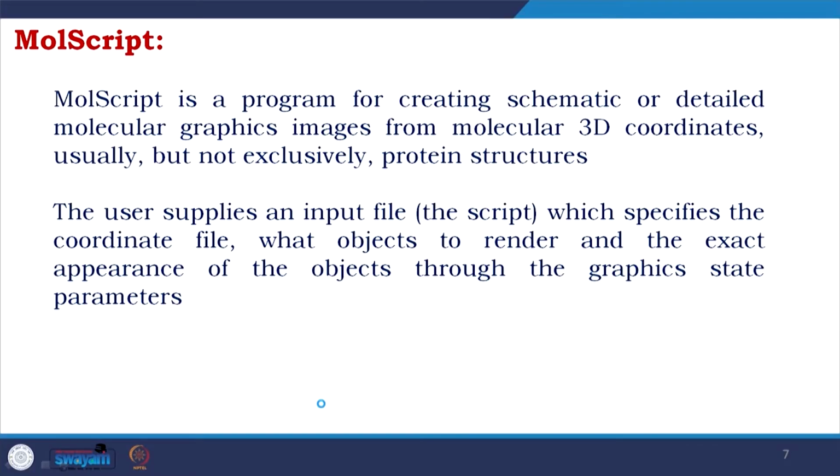The user supplies an input file. Actually, when I started my career as a PhD student, in the initial years, though PyMOL had already appeared, we used to make figures using MOLSCRIPT. It is not that we had to make the entire script. There are a lot of scripts there. We take that script and change it according to the requirements of our structure.